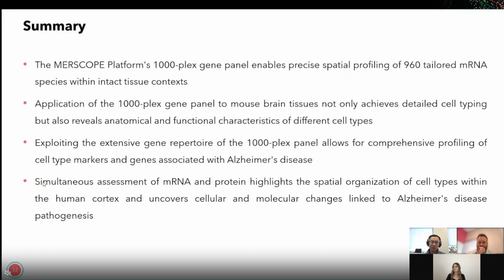And if you want to use some automatic annotation, that's also doable. I think there are some atlases or reference data that have been generated, and some algorithms can automatically annotate those cell types based on molecular information. But I think it's always helpful to check the annotation by plotting the cell spatial distribution, and then do some manual adjustment if you think that's not correct. Yeah, that's my answer.